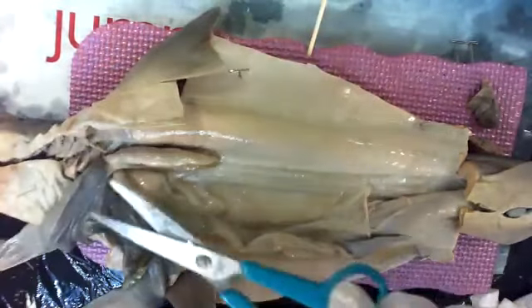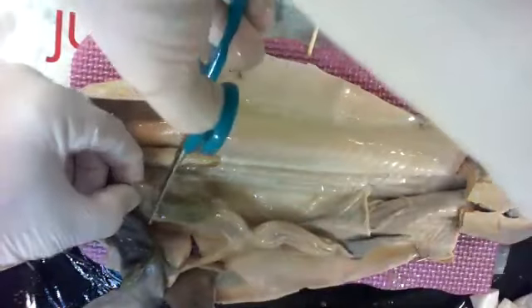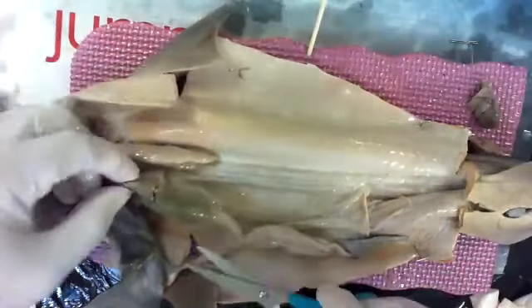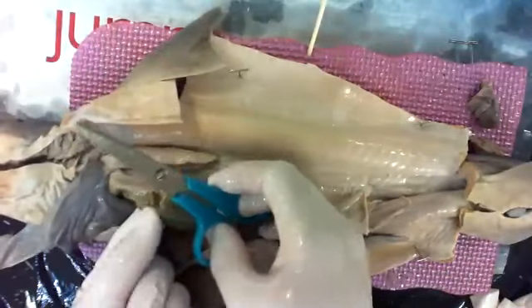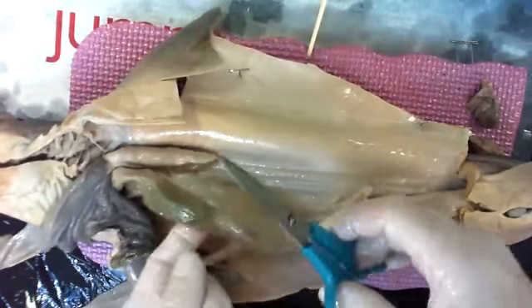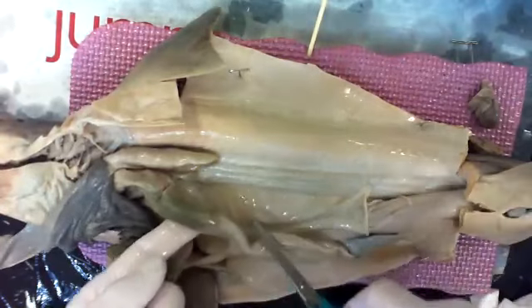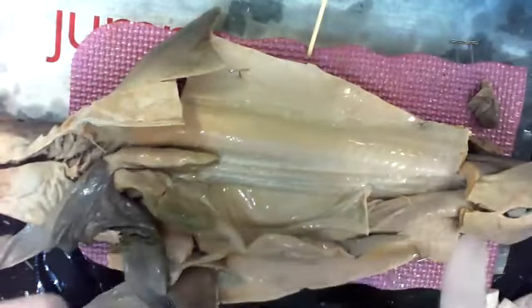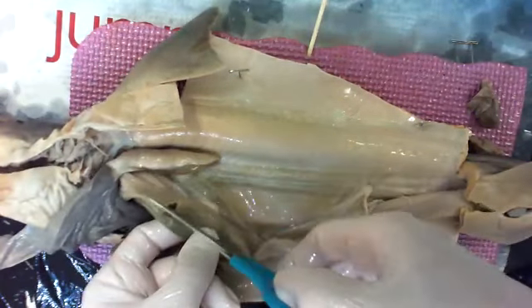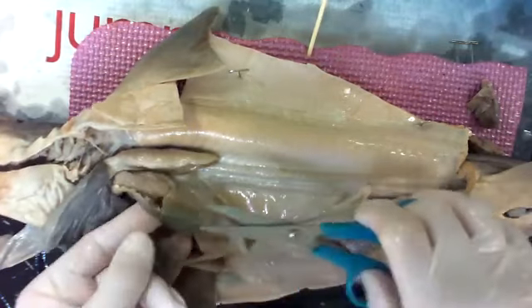I really dulled my scissors. Okay, so I cut into it a little bit. I'll cut further. I cut about halfway through it. Now I can open it up and take a peek in there. You might have a big lump in here, so there might be fish or shrimp. One time I opened this up and I had two fish and a shrimp. And the shrimp was like 8 inches long, curled up. Like, I've been eating, I give up. And then it just curled up into a ball.